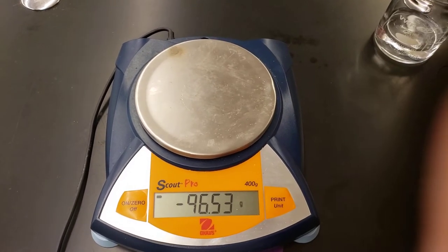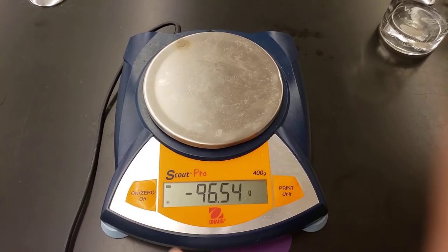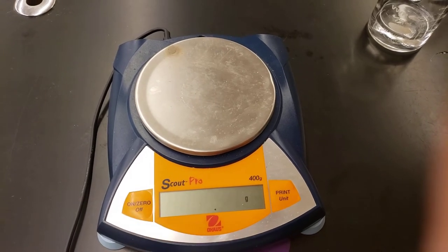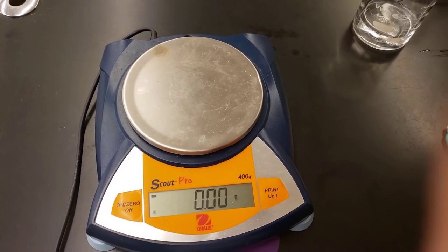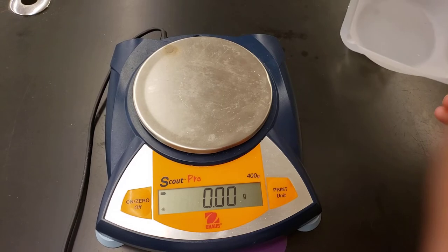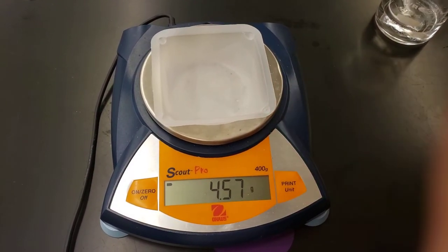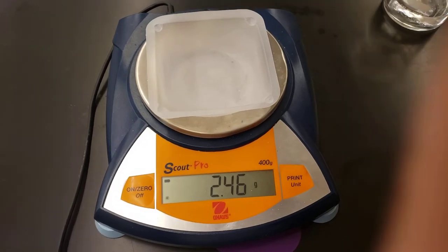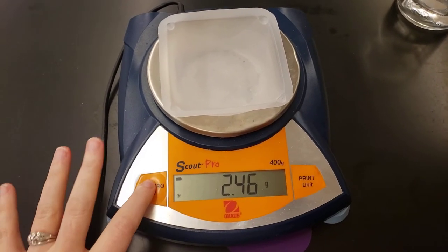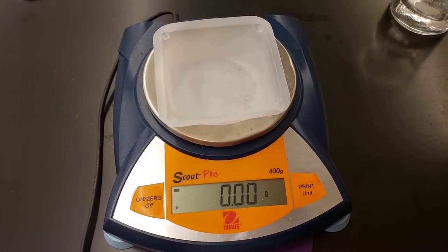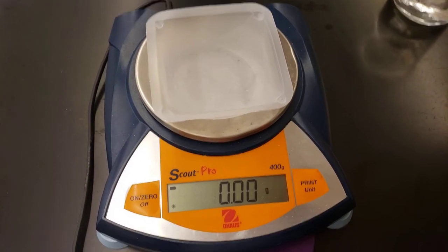Then we're going to remove our vinegar, set it to the side, not throwing it away. We're going to press that zero button again. Then we are going to put a weigh boat on and then we are going to press that zero button yet again so that it reads zero even though the weigh boat is still on there.